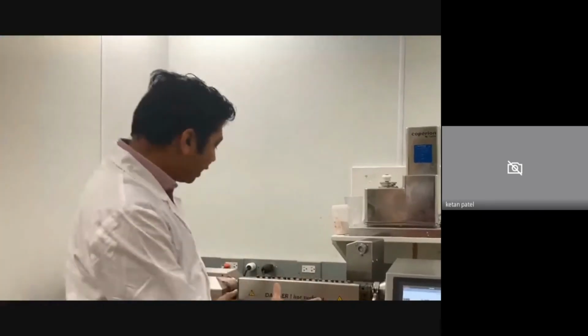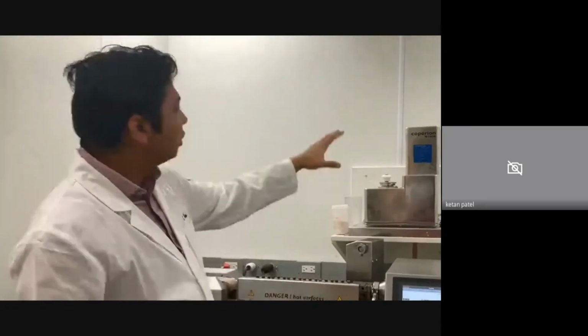So this is Process 11 by Thermo Scientific. In here, I think this is a feeder where we put polymer, drug, plasticizer. There are different kinds of pharmaceutical grade polymer, and that's what makes it different from conventional 3D printing for all other purposes. For pharmaceutical purposes, you need to have an FDA approved excipient, and that's what we have to use within the limit of inactive ingredients. So far, what we know is HPMC, polyvinyl pyrrolidone, polyvinyl alcohol, hydrogels, and that kind of polymer we usually use.